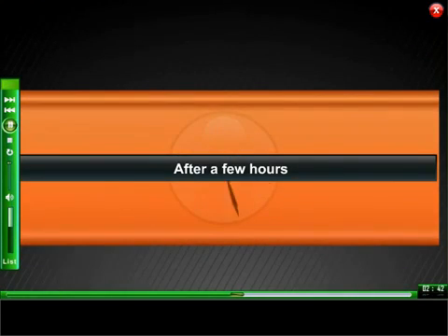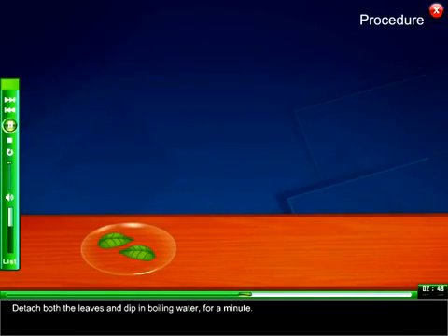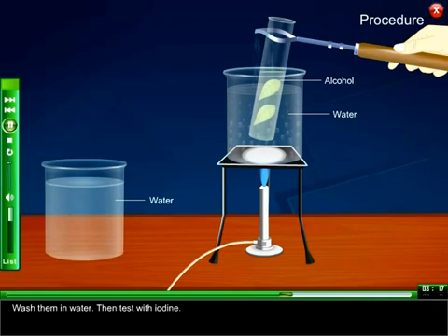After a few hours, detach both the leaves and dip them in boiling water for a minute. Now boil them in alcohol over a water bath until they decolorize. Then wash them in water.